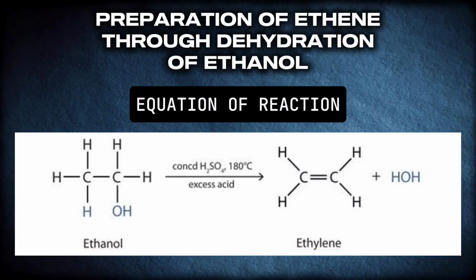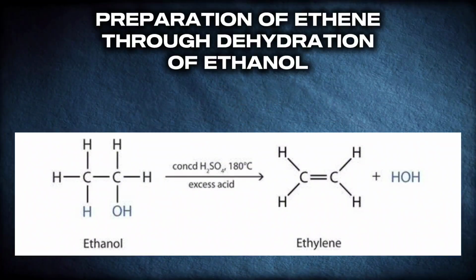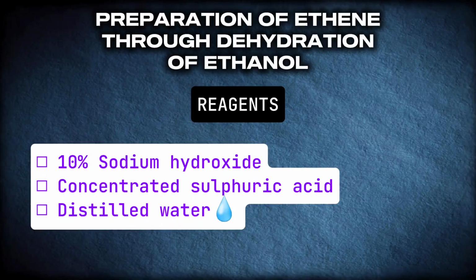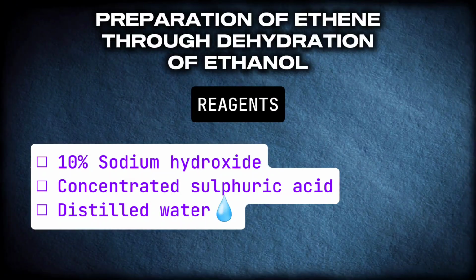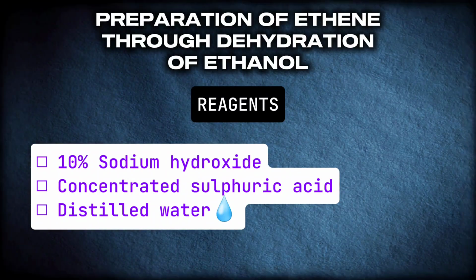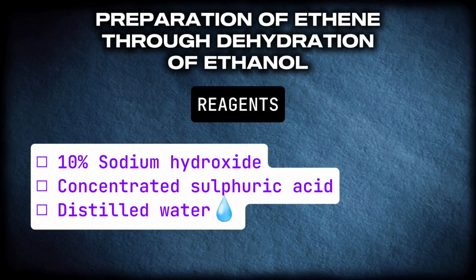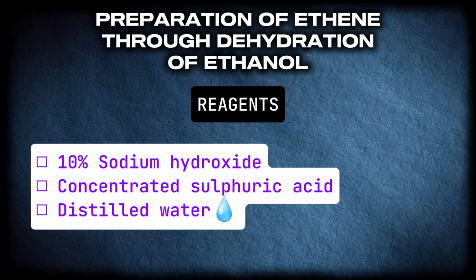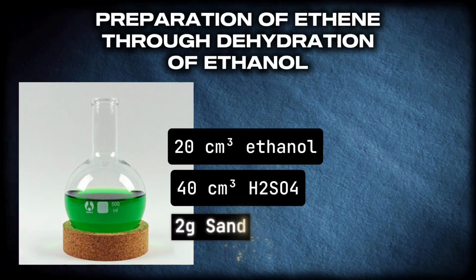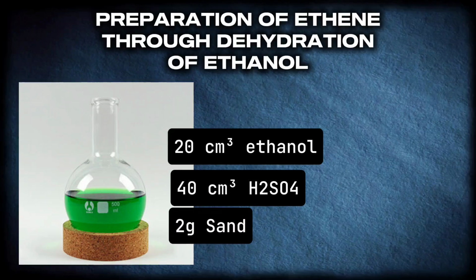So in this experiment, you're expected to introduce some given volume of ethanol, right? It has been stated in your manuals, in a given volume of round bottom flask. All right, and this is followed by introduction of a given volume of the sulfuric acid, which is going to serve as the catalyst for the dehydration process. And once this is done, you have to introduce the sulfuric acid while shaking just slowly into the round bottom flask containing the given volume of ethanol.